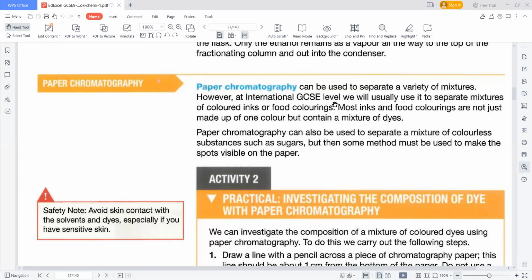So chromatography enters in. Just say you mixed up two to three inks into each other, and now you want to separate them. The review is that you place spot lines on every specific color and make a standard there. Why? Because everything has to travel along that particular standard to let you know whether a substance is present in it.